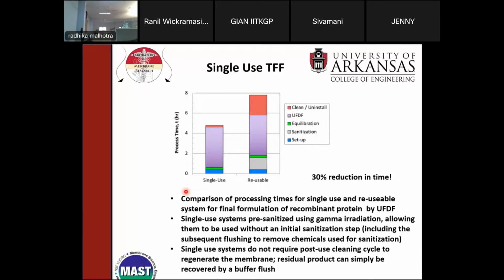So that's the time taken. For a single-use device with the same feed volume, you have about the same time for equilibration, but you don't have the sanitization and cleaning time. So you can see there's a reduction in time. That's a big advantage of this, and in the example, it is a very big one.